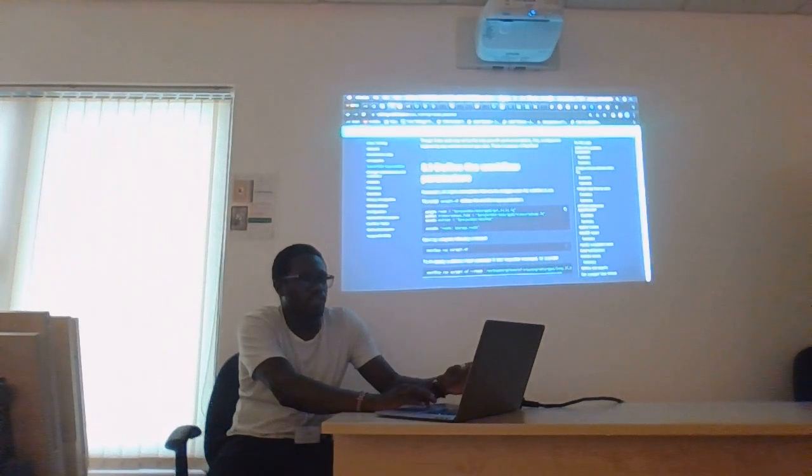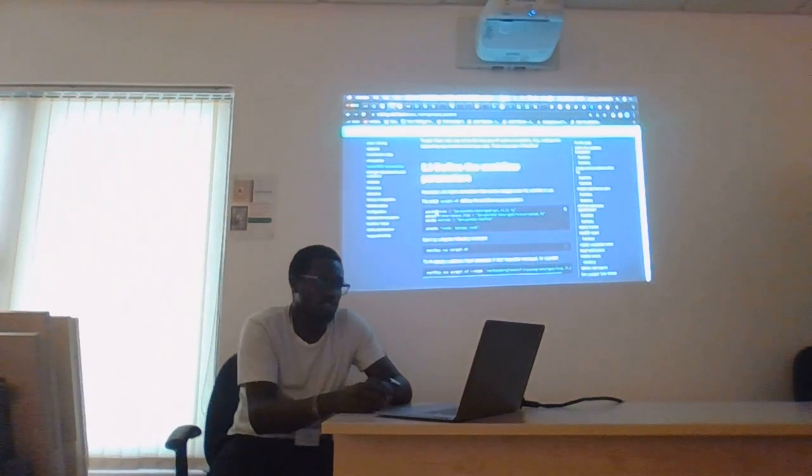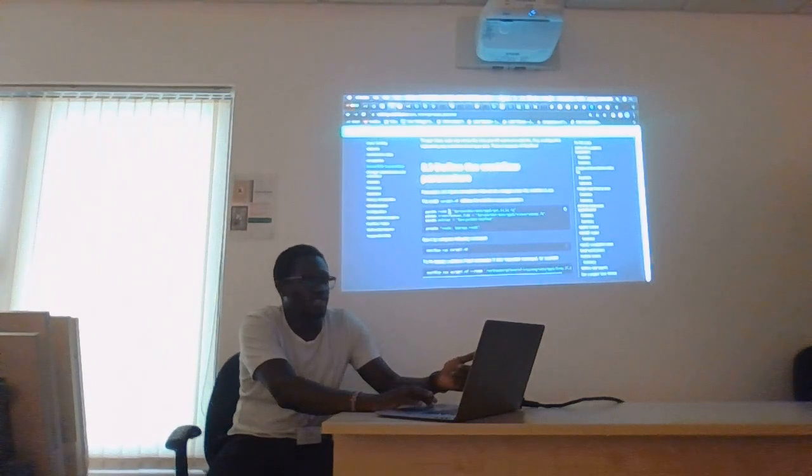So Nextflow has a keyword called params, which specifies the argument or the options required for a particular parameter. So for instance here, we are defining that there is a parameter called reads, and we specify the path where those reads are.